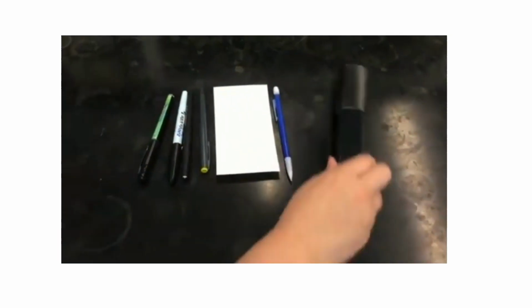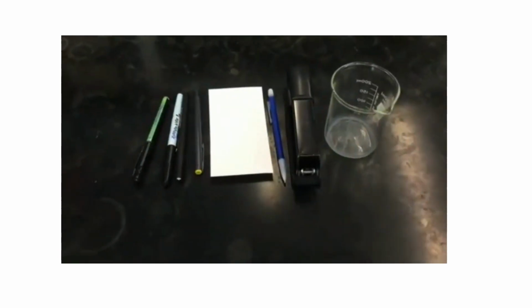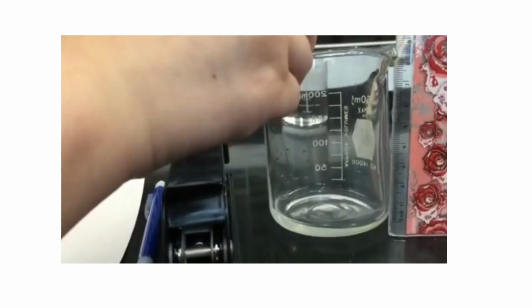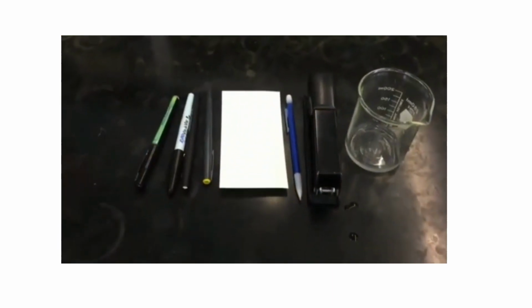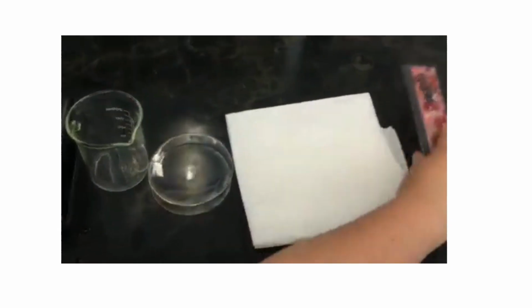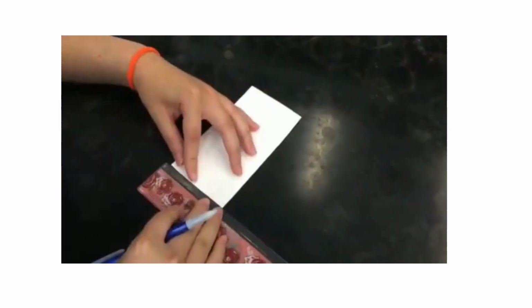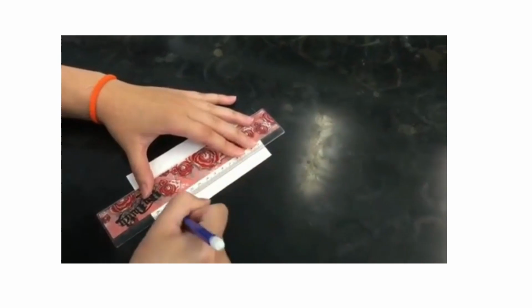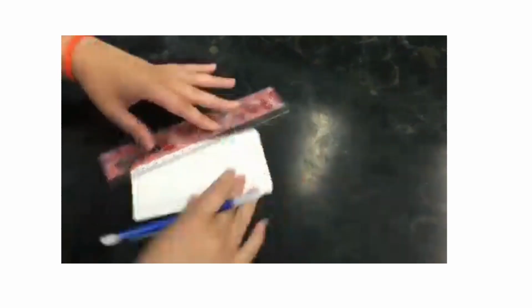Now you can see these things here. See what is happening here. You need a chromatography paper, pencils and pen, and then a jar. The jar is first rinsed with distilled water, and we are taking ethanol in it. Now these are the papers and the ruler. See how they are plotted. The plots are kept even, so that the distance must be even. So we are using a ruler.